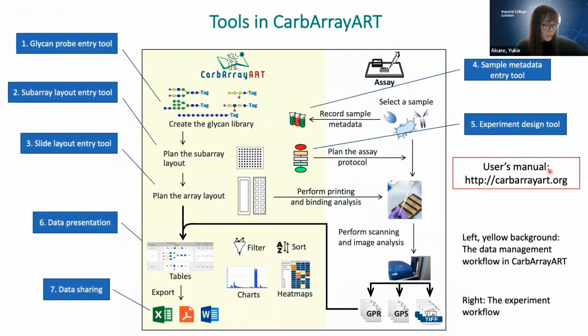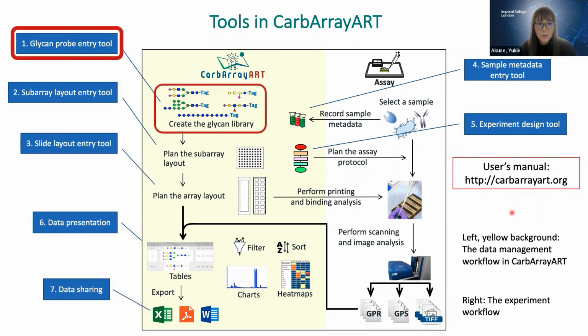So here, yes, I'd like to run through the 7 tools, but again, there are more functions, and I'm not sure how much I can explain in this next half an hour. So for more information, please have a look at the user's manual. And then I'd like to start with the Glycan probe entry tool.